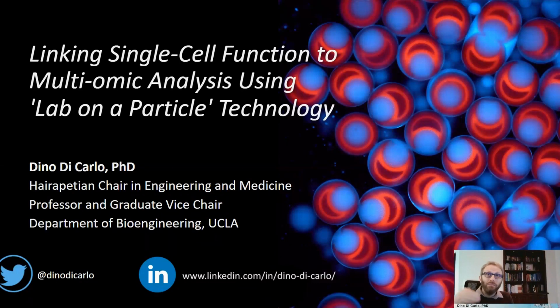So we're moving to the next level of how can we use the infrastructure that's in place today, things like flow cytometers, things like single-cell sequencing systems, and by adding a new unit, a particle that can interact with cells and capture things from those cells, how can we open up new capabilities? For example, linking the functions of cells to their transcriptomes or other genomes or epigenetic changes in those cells.